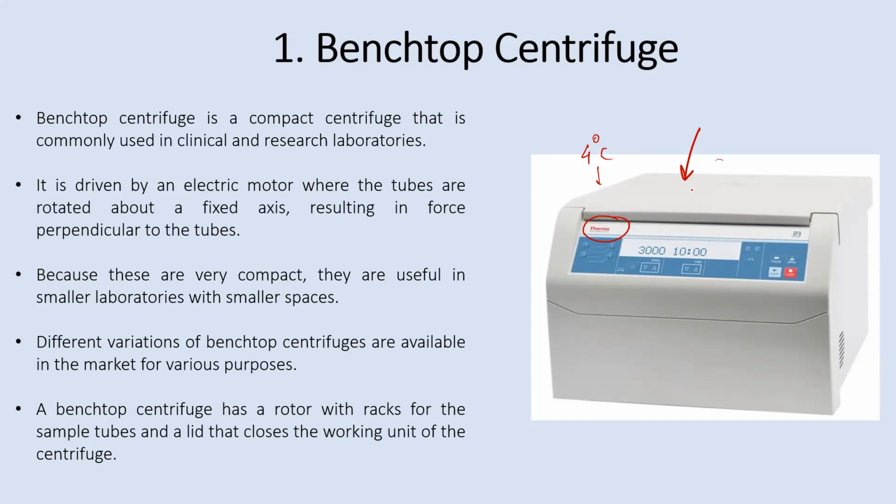If you leave it open, the outer air will warm it up. So centrifuges do not work unless you close the lid. If you leave the lid open and press the start button, you get a command on the screen, lid open. Unless you shut the lid, the centrifuge will not work.